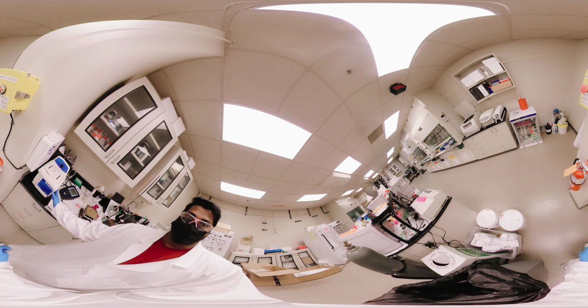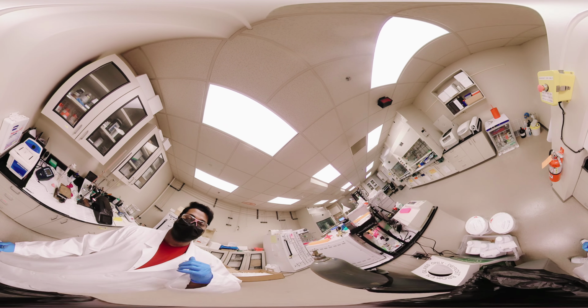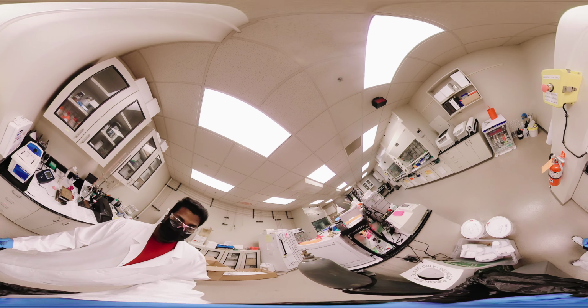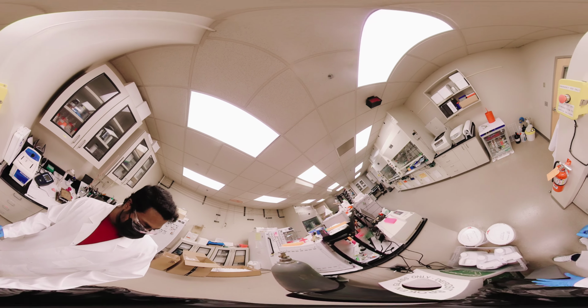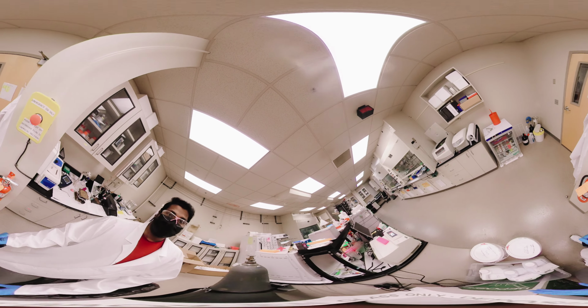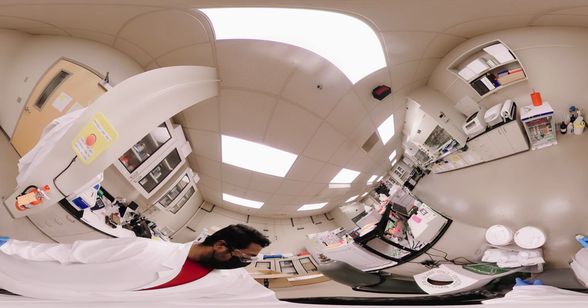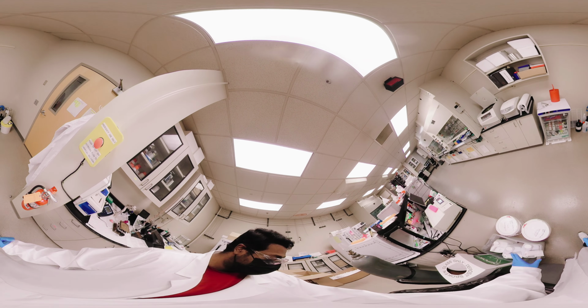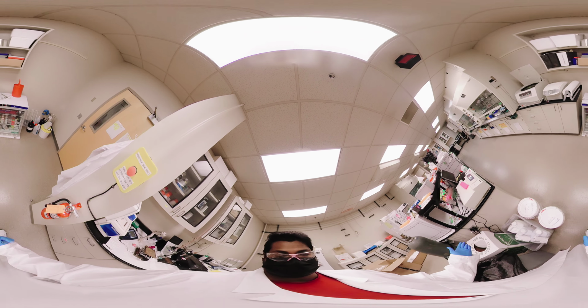We have a bath sonicator, which we use to disperse our material very well in solutions. And this is the chemical waste station. We throw all our chemicals in a bucket or pail. The liquid waste goes to this one and the solid waste goes to this one. We are not throwing anything in any sink.